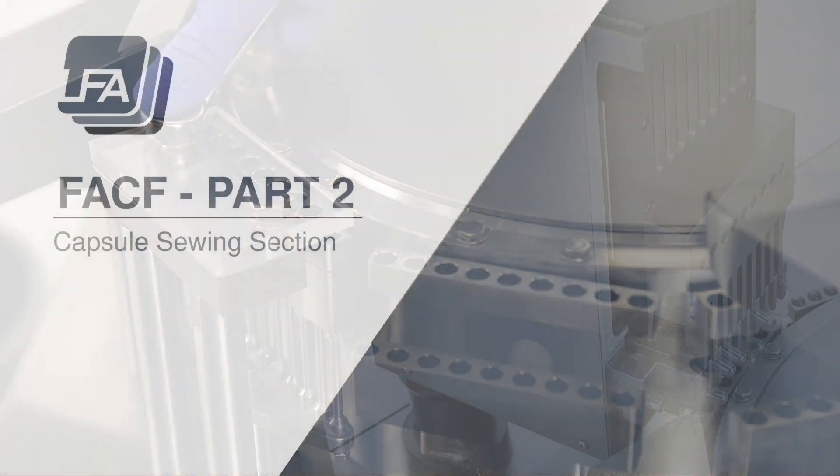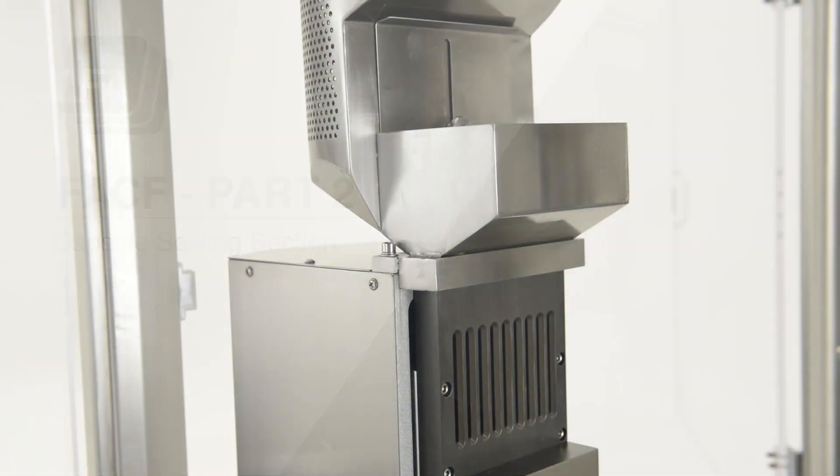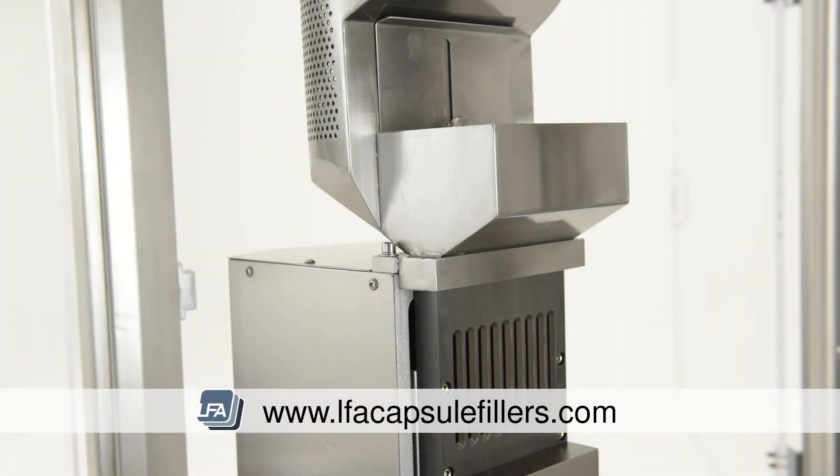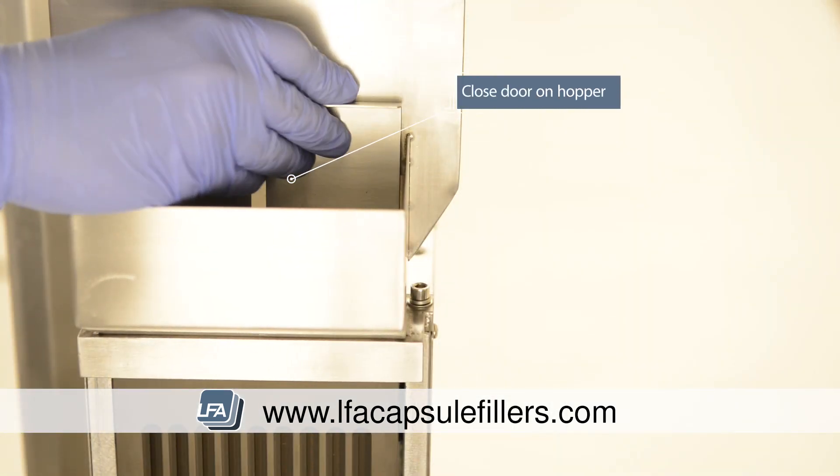Next is part two: the capsule sewing section. We need to change the tooling in the capsule sewing section to match up with your new tooling on the main turret. First, close the door in the hopper to prevent any further capsules from falling into the sewing section.